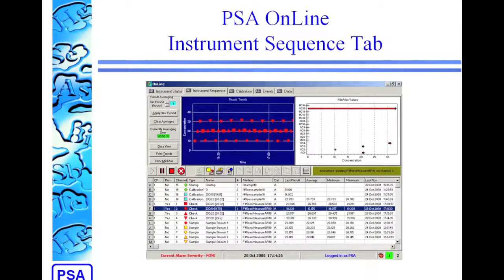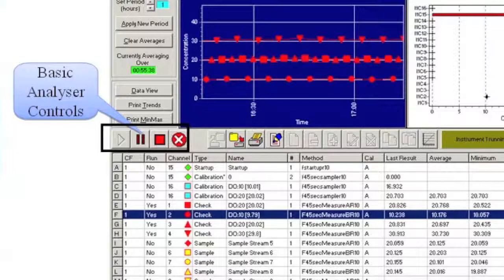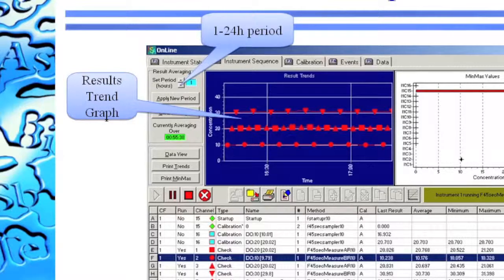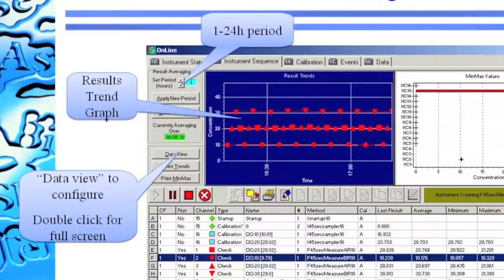If we go behind the main page and look at the instrument sequence, this is where a bit more detail of how the analyzer is operating is configured. We have a few different areas on here. First of all, we repeat the basic analyzer controls that were also on the primary interface. We also have a graph showing the results trend. This can show anything from 1 to 24 hours, and is user configurable both in how the points are represented on the graph and in the concentration range that's shown. To change the configuration, you go to the Data View tab.